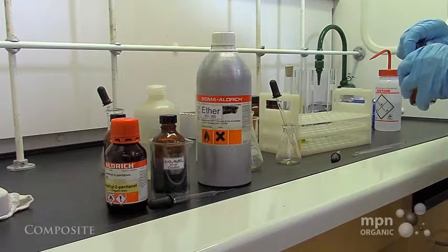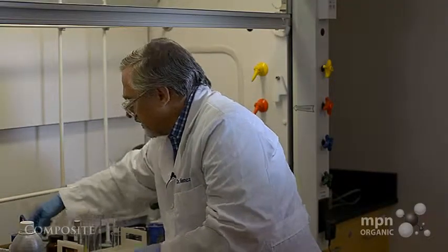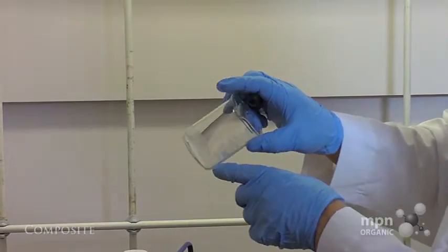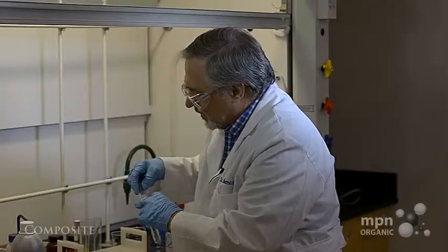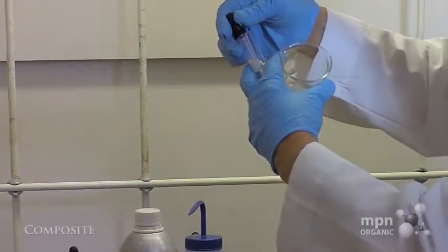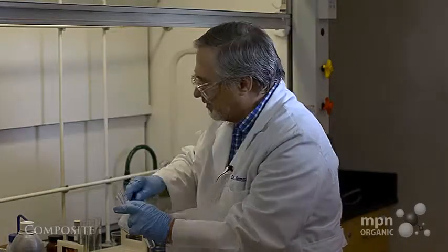Okay. All right, let's go to the iodoform test. Once again, there isn't a whole lot of material in here. Okay, it's a very, very small amount. So let's go ahead and do that. So I'm going to take some of this out again. I'm going to put it down in here. Let's get as much as we can. Okay, there.